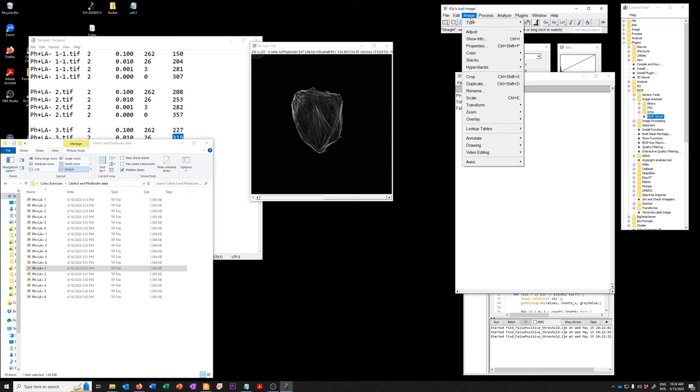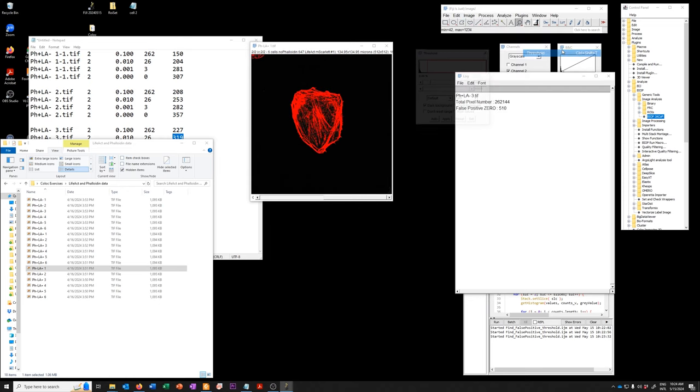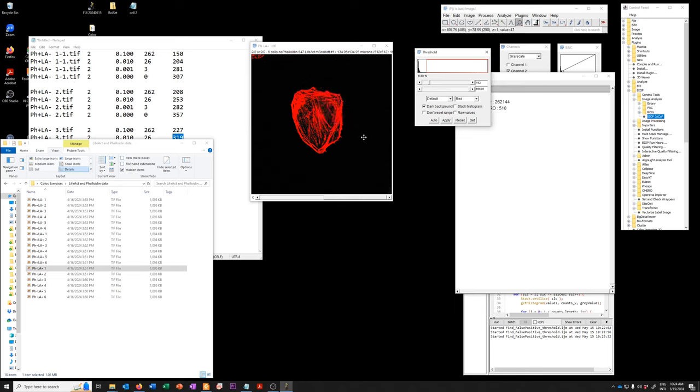I'm going to open the thresholding tool. And the average of the 0.01 is about 250 or 260. So I'm just going to set that here so we can see. So you can see that's a pretty reasonable threshold.